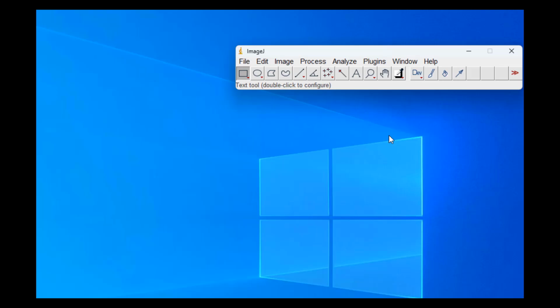Then, before we begin, we need to install the macro that I wrote. I didn't really write it. I found an existing macro, and I give credit to whoever wrote it within the macro. I can't remember where I found it, but it's a heck of a useful macro that somebody else wrote, so thank you for that. I just took it and modified it for our purposes. And so we need to install that before we do any analysis.